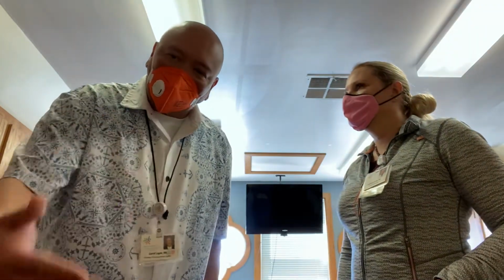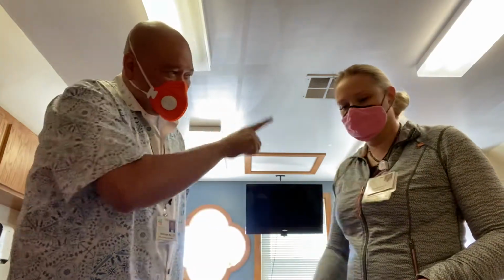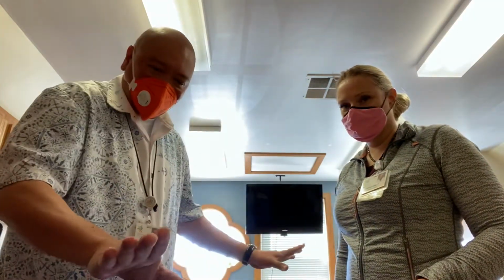Now, in this process, we'll talk about the step-by-step on how to put on your PPEs and how to take off the PPEs, aka donning and doffing of PPEs. Okay. First step after hand sanitation, make sure all the hair, all the jewelries are gone. Wear proper clothing. Next, put on your gown.